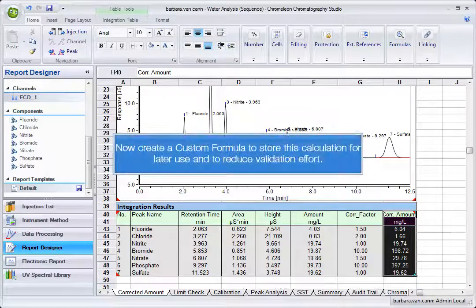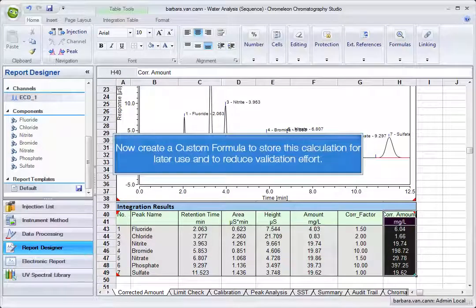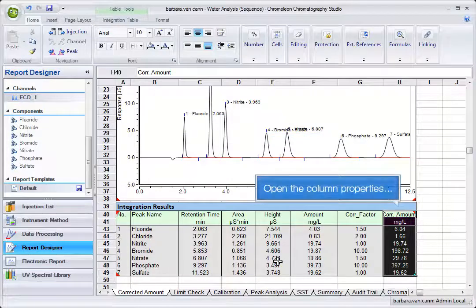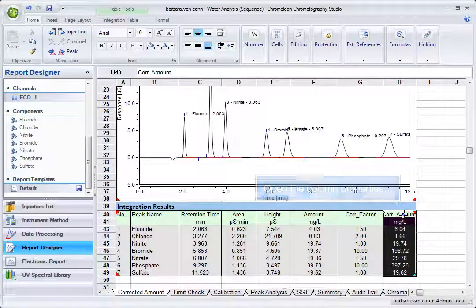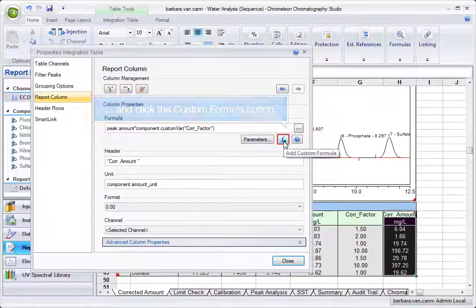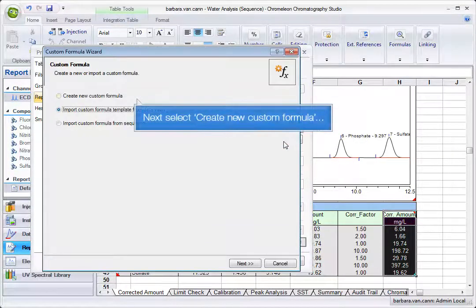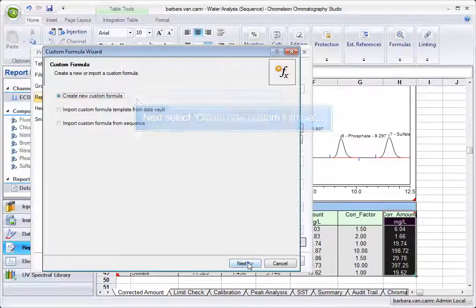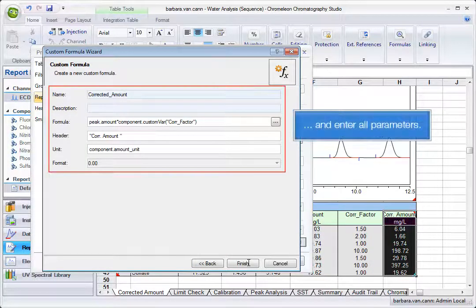Now create a custom formula to store this calculation for later use and to reduce validation effort. Open the column properties and click the Custom Formula button. Next, select Create New Custom Formula and enter all parameters.